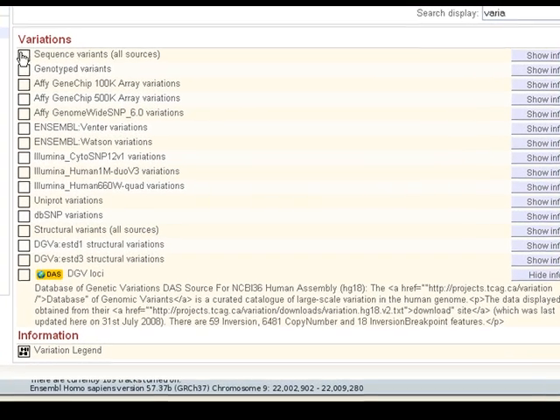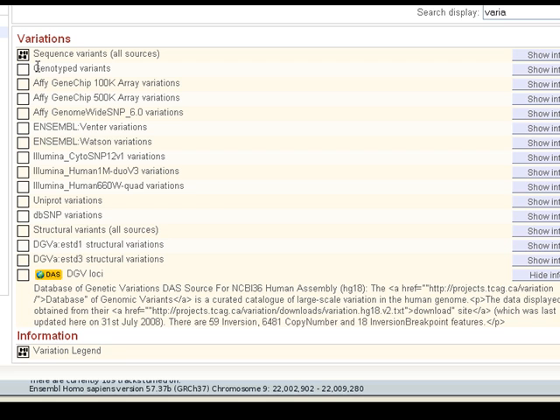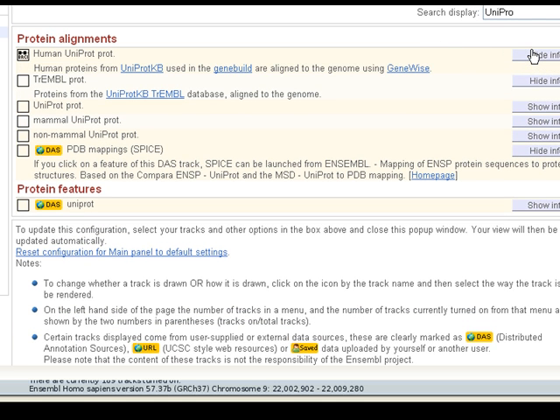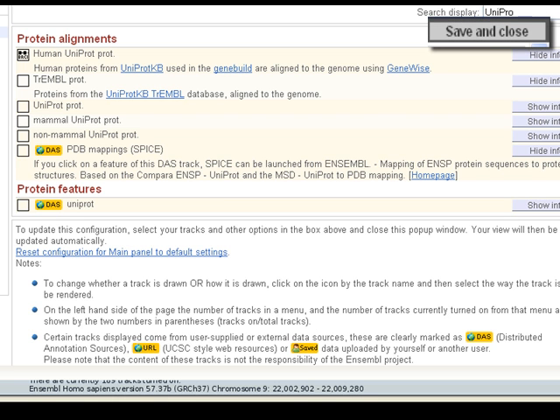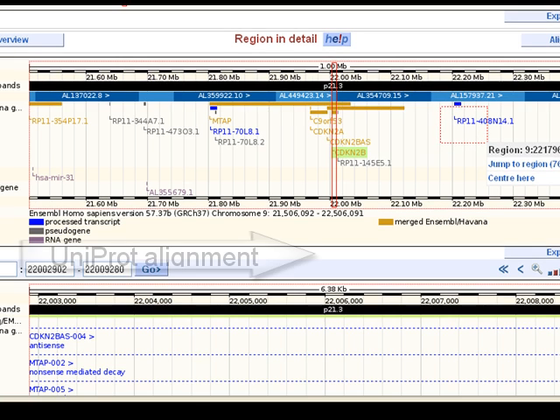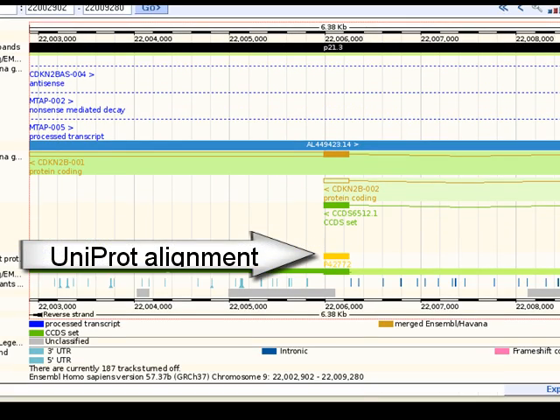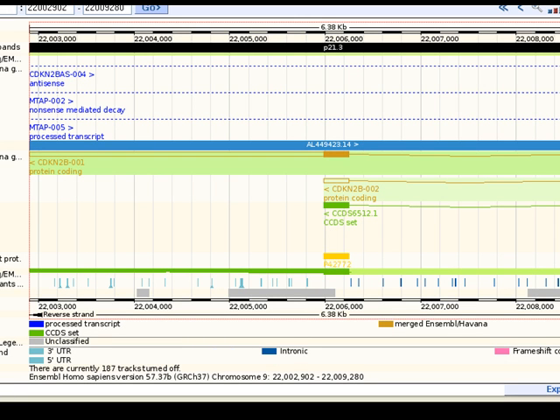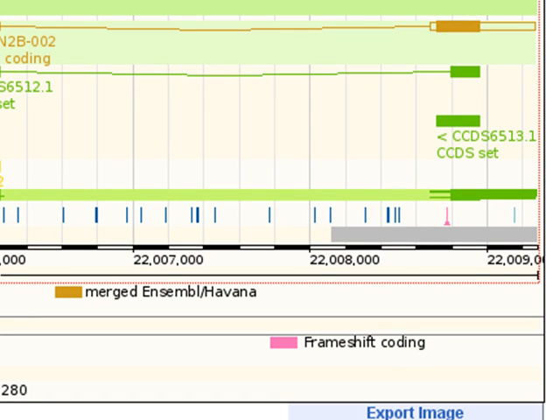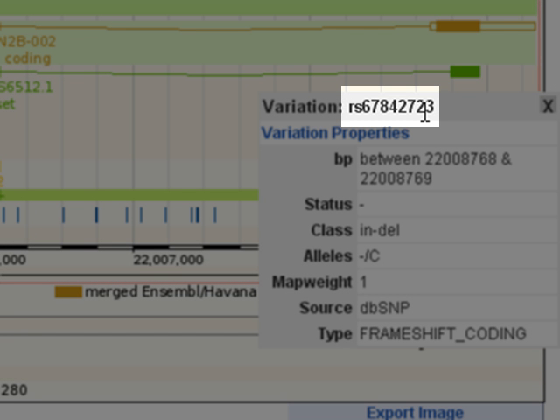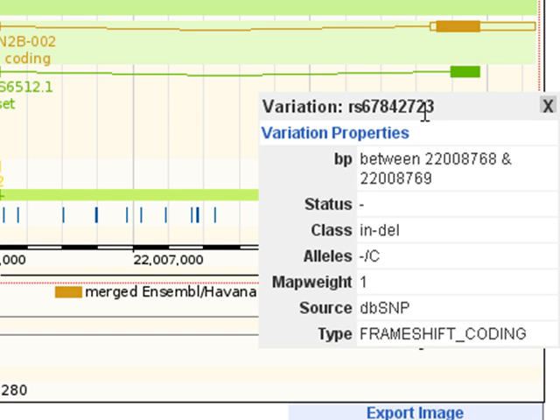Let's choose to see variations — select 'sequence variants, all sources'. Let's also add UniProt alignments. Click 'show information' to learn more about this source, then save and close the menu. The page should reload. You might see that a protein from UniProt aligns to the region of the genome. Variations are shown as vertical lines along the genome; triangles indicate insertion-deletion mutations. Click on the pink frameshift coding variation and a variation box should appear. This insertion-deletion mutation has an rsID from NCBI dbSNP.